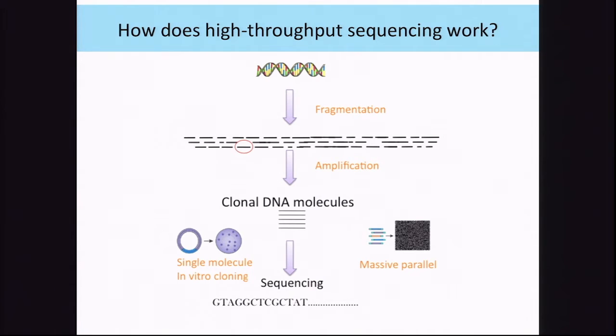We take these small fragments and we clone them. We make many copies, and it is the result of this cloning that is given to the sequencers. The sequencers read these short reads and give us short sequences of letters A, C, G, and T.